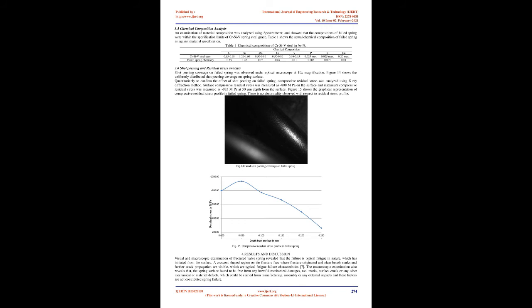Scanning electron microscope analysis reveals the presence of a nonmetallic inclusion about 117 µm beneath the surface, and fatigue initiated from the same location and further propagated towards the core. The nonmetallic inclusion measures 26.1 µm x 3.58 µm in size. Energy dispersive analysis, EDAX, reveals that the composition of the nonmetallic inclusion is of silicate type. The silicate type nonmetallic inclusion is assumed to be residues of silicon, carried from the steel making process, where silicon is used as an alloying element and as a deoxidizer.